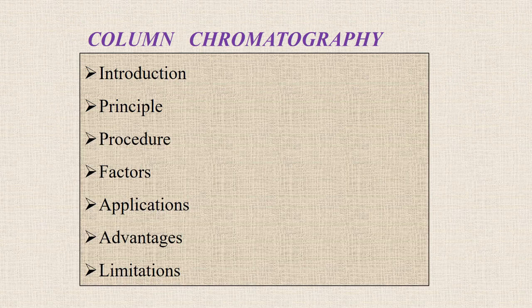The contents are: we will study the introduction, principle, procedure, what are the factors affecting the separation in column chromatography, its application, advantages and limitations.